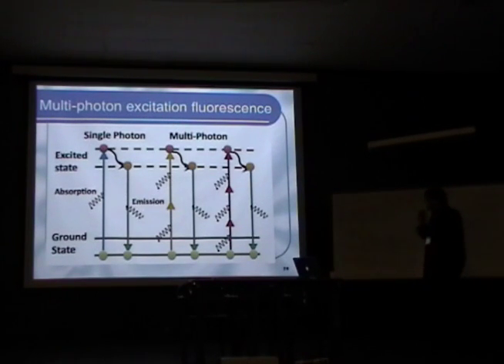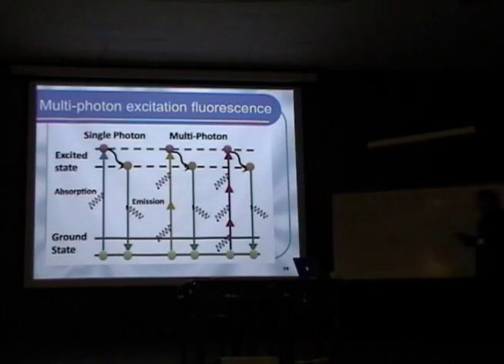To summarize what we have discussed, we've seen that in order to excite chromophores, we can of course use a single photon excitation process, which has some advantages but also disadvantages.